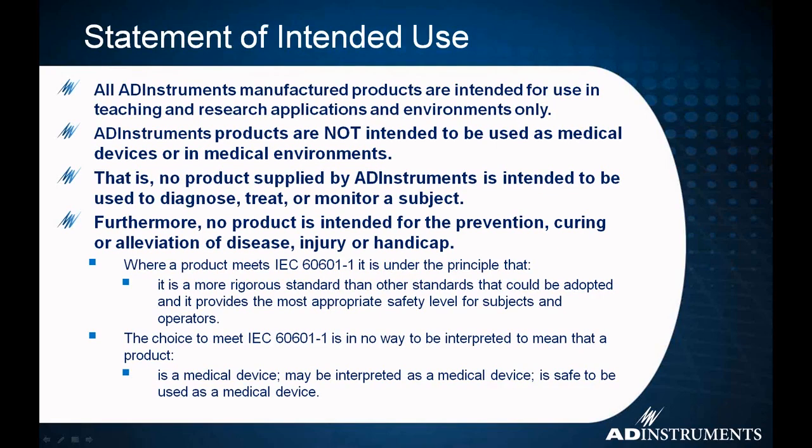Quite often we get a variety of questions about how I can use my AD Instruments equipment. How can I use LabChart? What can I use it for? You don't have to go through here and read and memorize all of this, but the take-home message is that AD Instruments products are not intended to be used as medical devices or in medical environments. They can be used in clinical research, but they cannot be used to diagnose, treat, or monitor a subject. So definitely research only. It cannot be used for actual treatment.